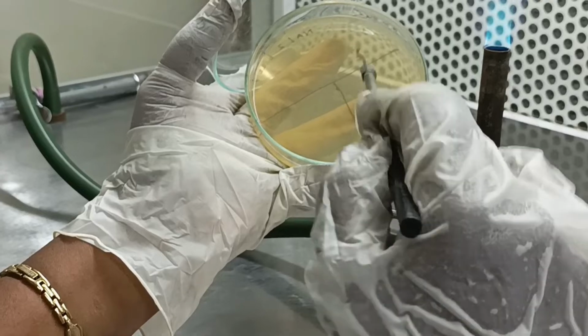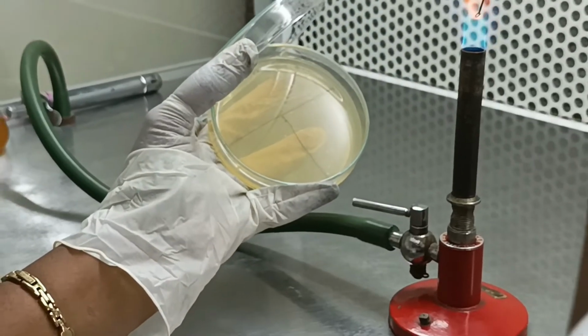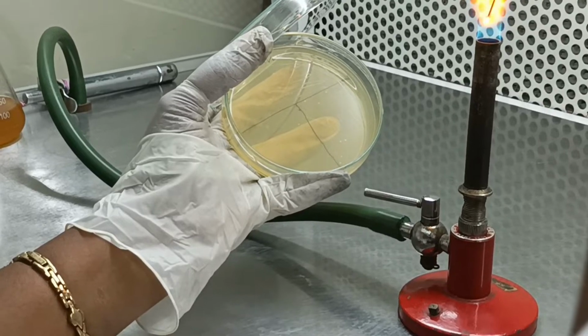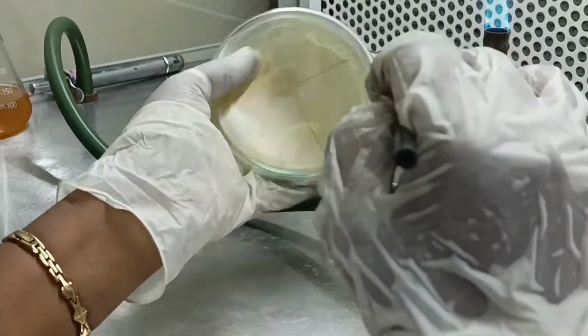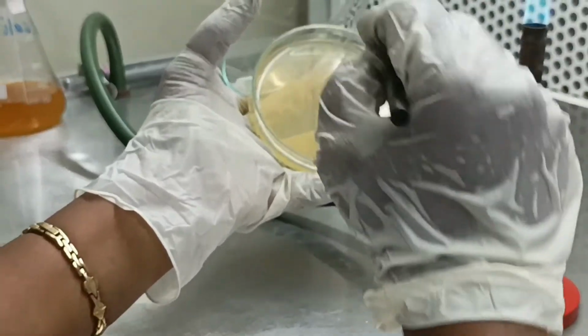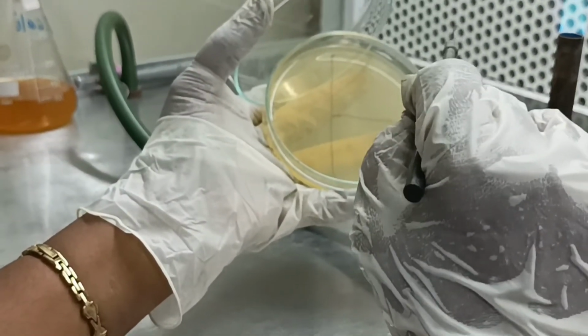Flame the inoculating loop once again. Rotate the plate 90 degrees. Track the loop lightly from the first section towards the second section and repeat the zigzag pattern.